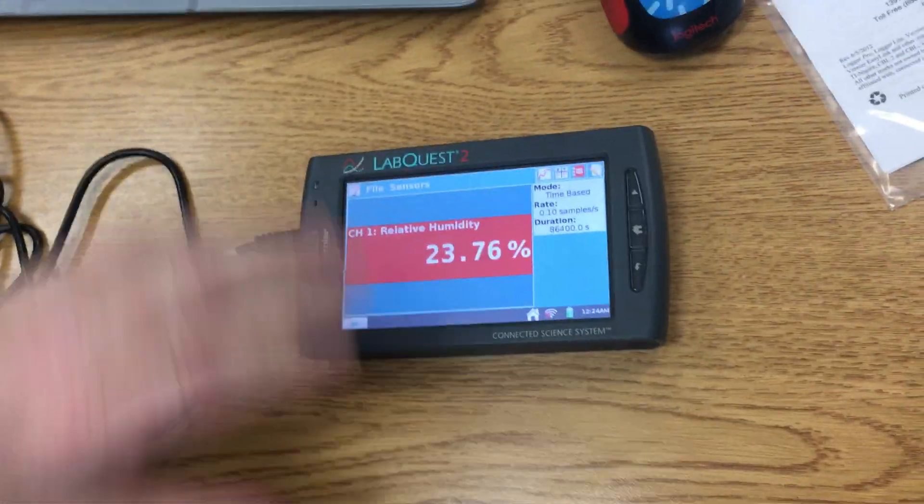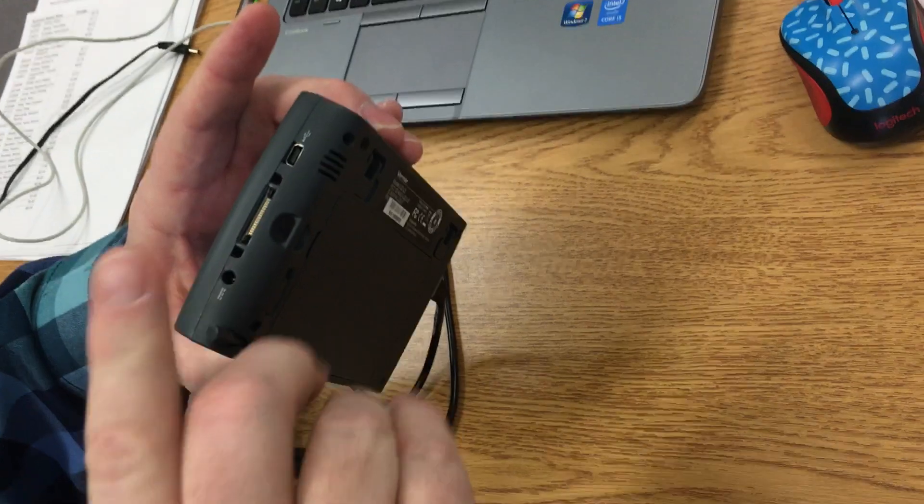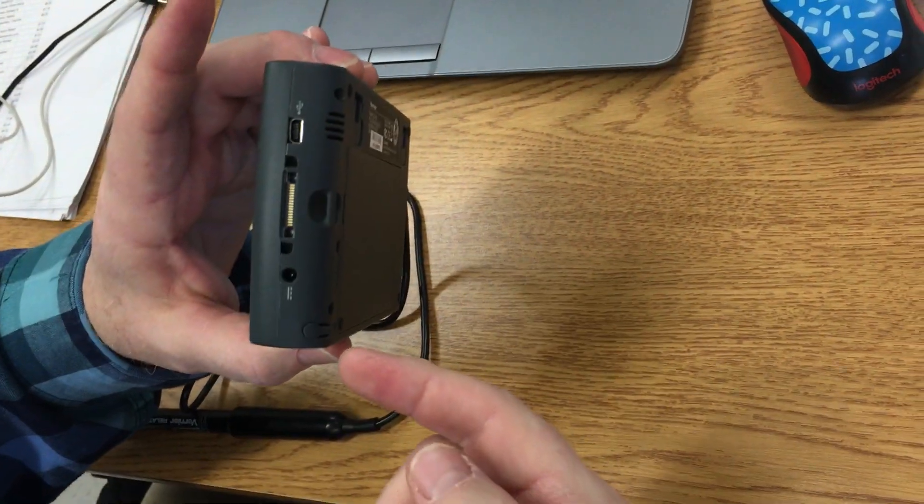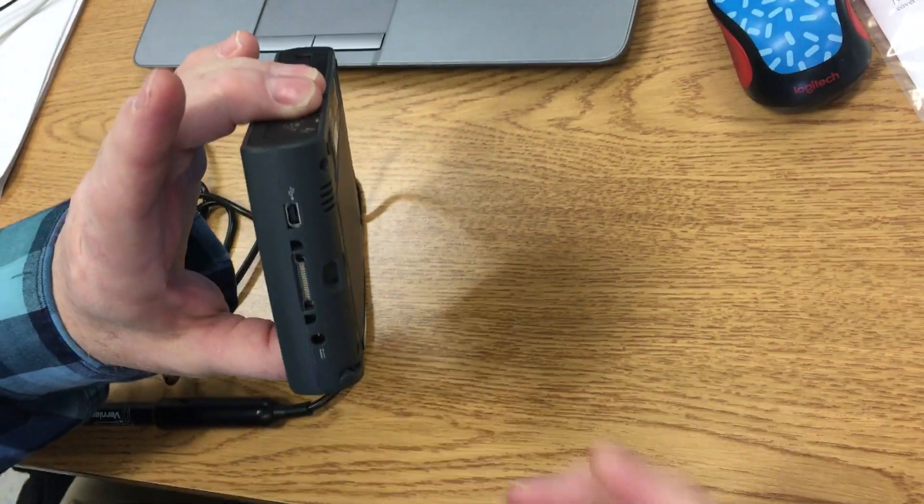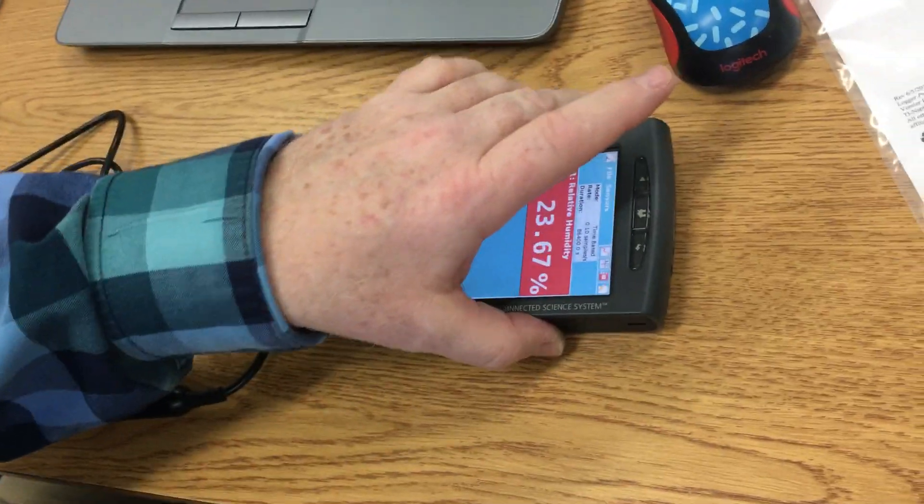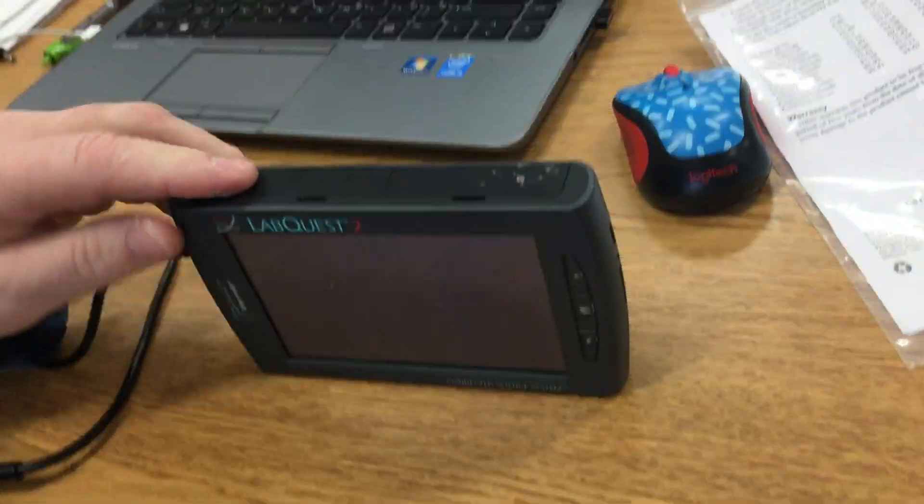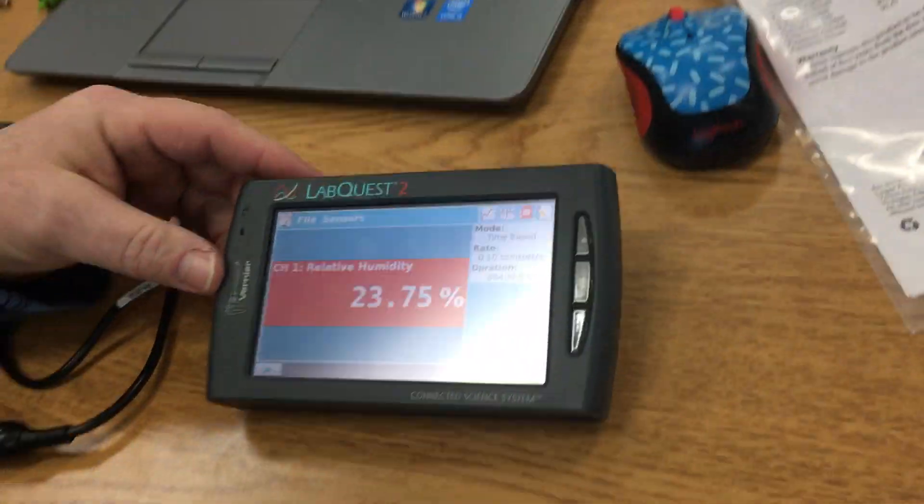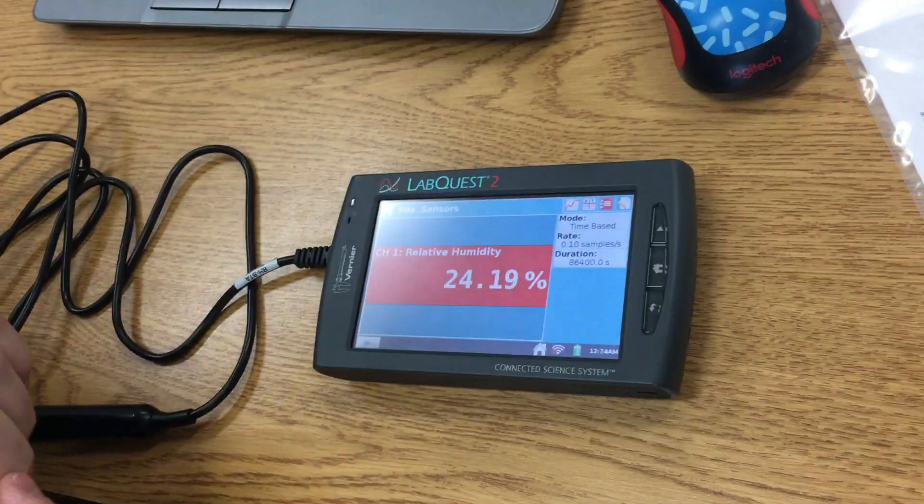We're going to need to get the stylus, which is this thing right here, this little pen. I need to pull it out. Some of them are attached; this one is not. We're going to need to orient it this way so it's easier for you to see.